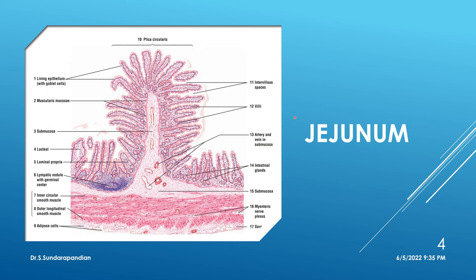Next we will see the slide of jejunum. Here also you have to see for all the four layers: mucosa, submucosa, muscularis externa, and serosa. In this slide you are able to make out plica circularis — the permanent mucosal fold present in the small intestine that increases the surface area.